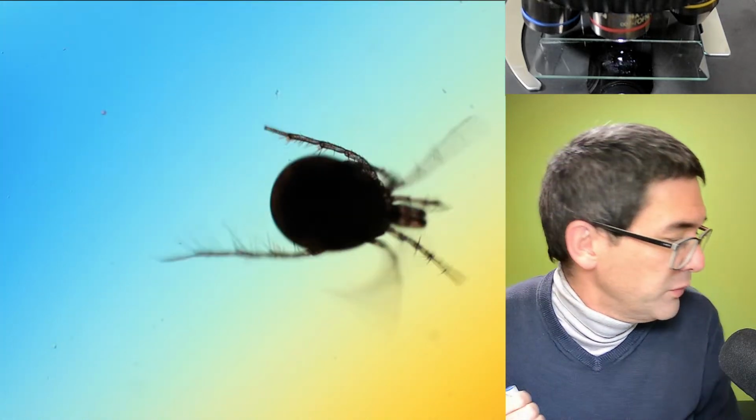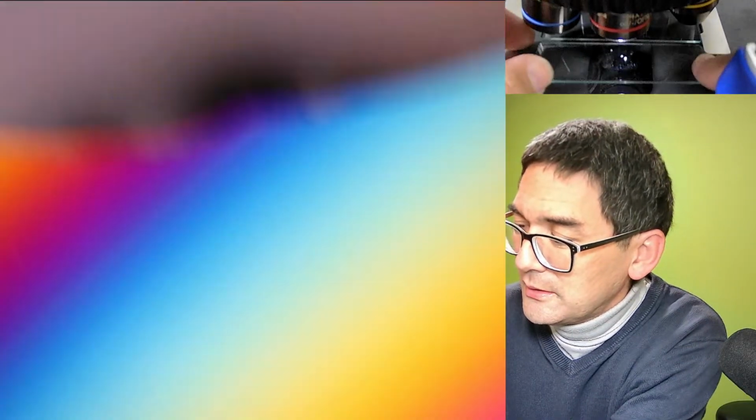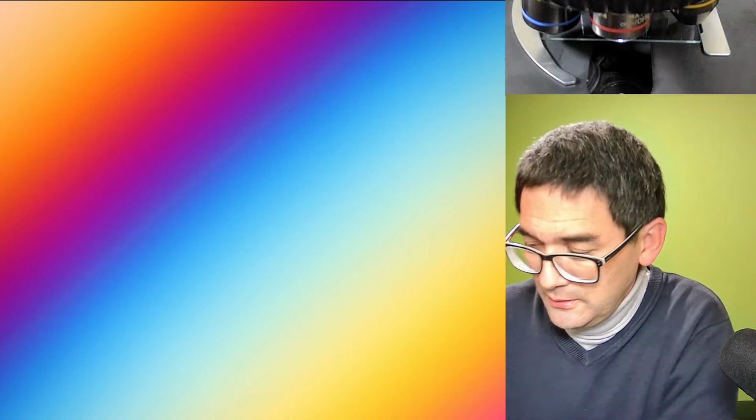Okay. Yeah, crawling around. I have to do the following now. I'm going to try to take some of the liquid away, so that it's not able to move quite as much. And then maybe it's going to be a little bit more stationary. So let me take it away again. And I'll just show you again on the desk what I'm doing here.